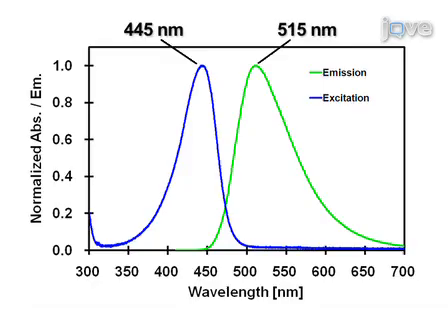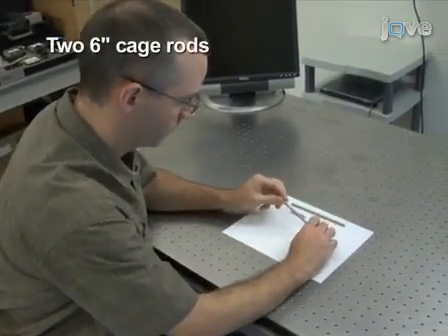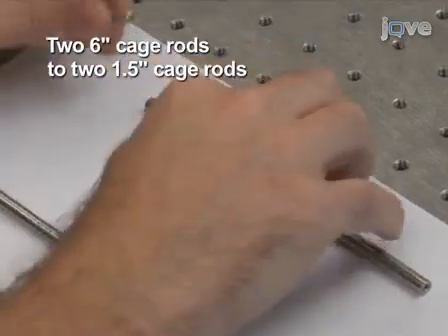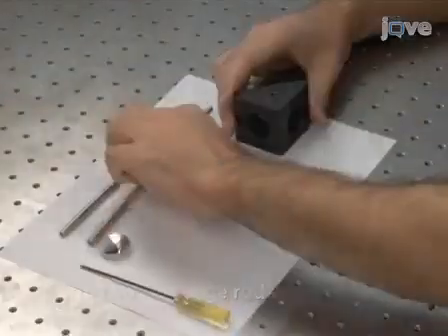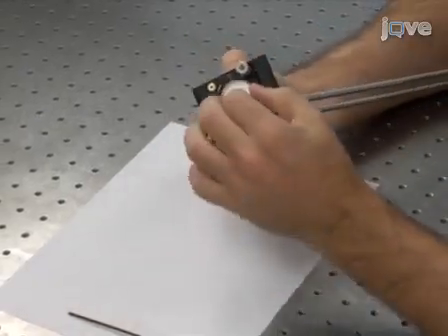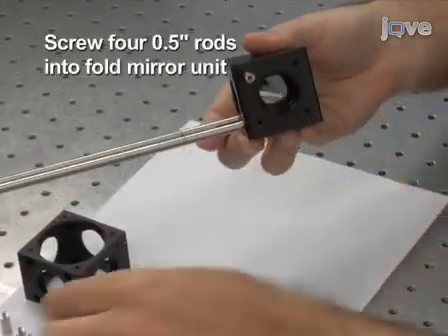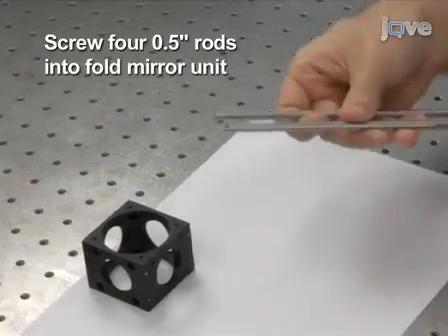To assemble the microendoscope system, begin by connecting two 6-inch cage rods to two 1.5-inch cage rods to form a pair of 7.5-inch long rods. Screw the rods into one face of the fold mirror unit. Then install a 1-inch diameter mirror. Next, screw four 0.5-inch rods into the opposite face of the fold mirror unit.